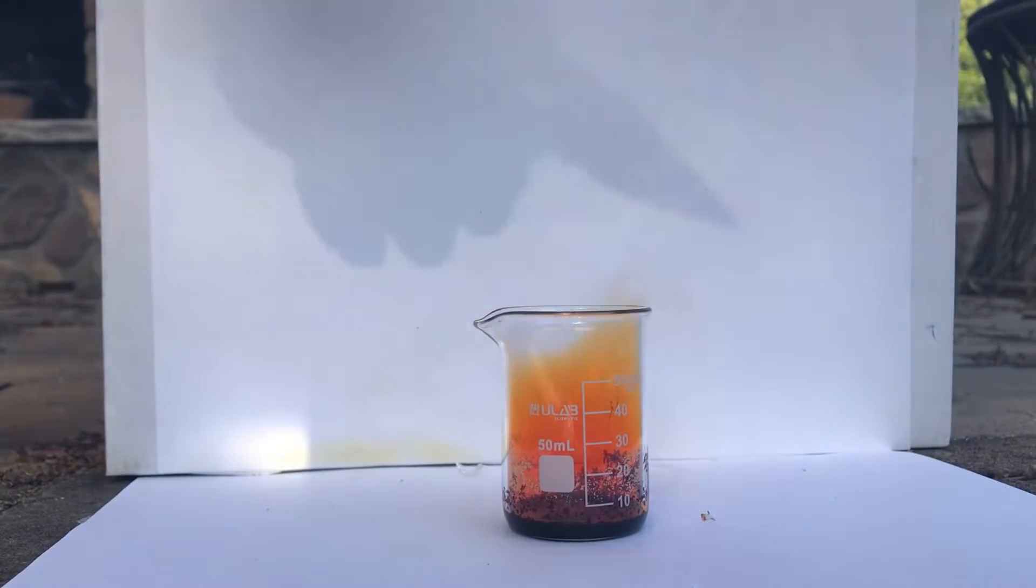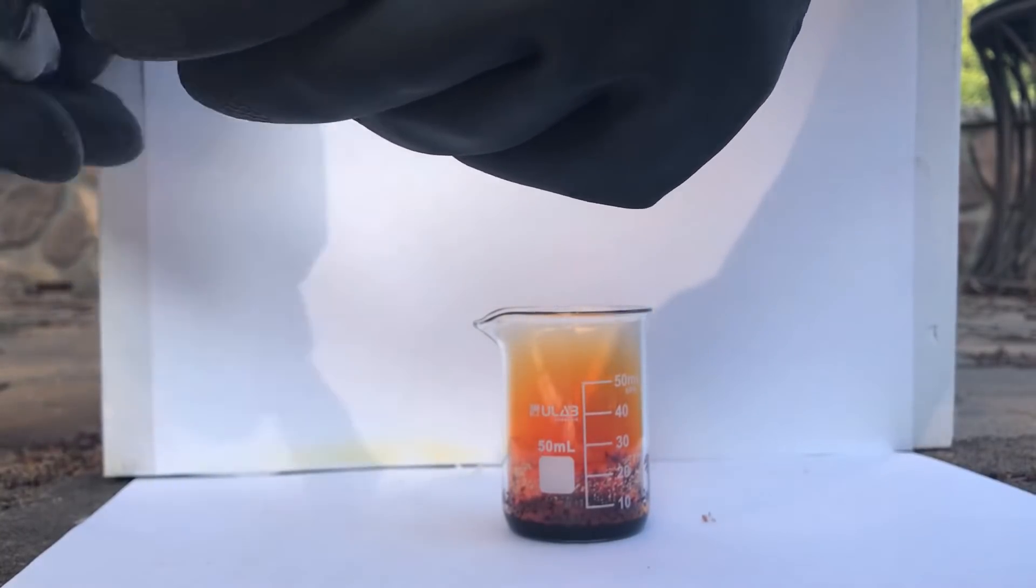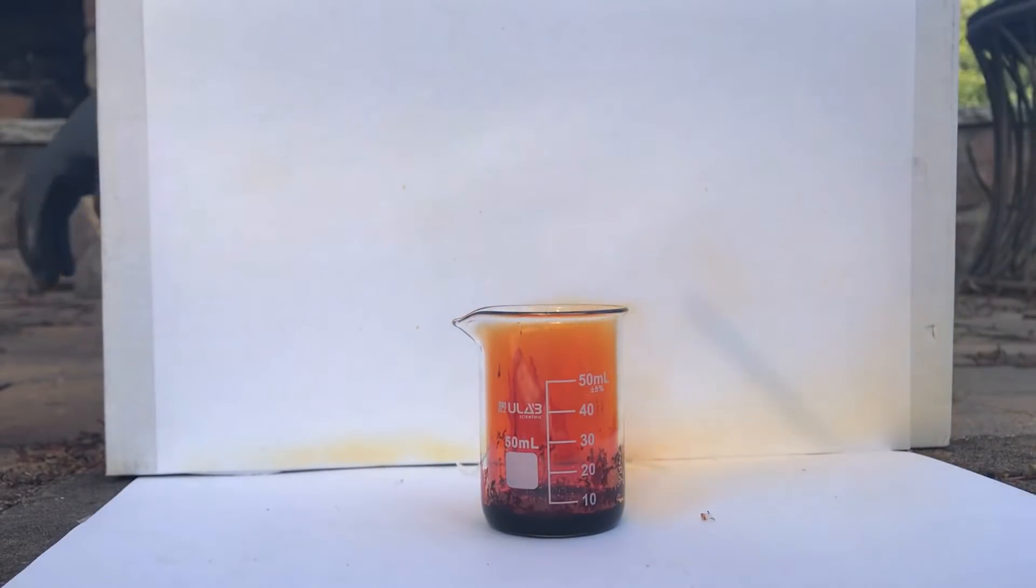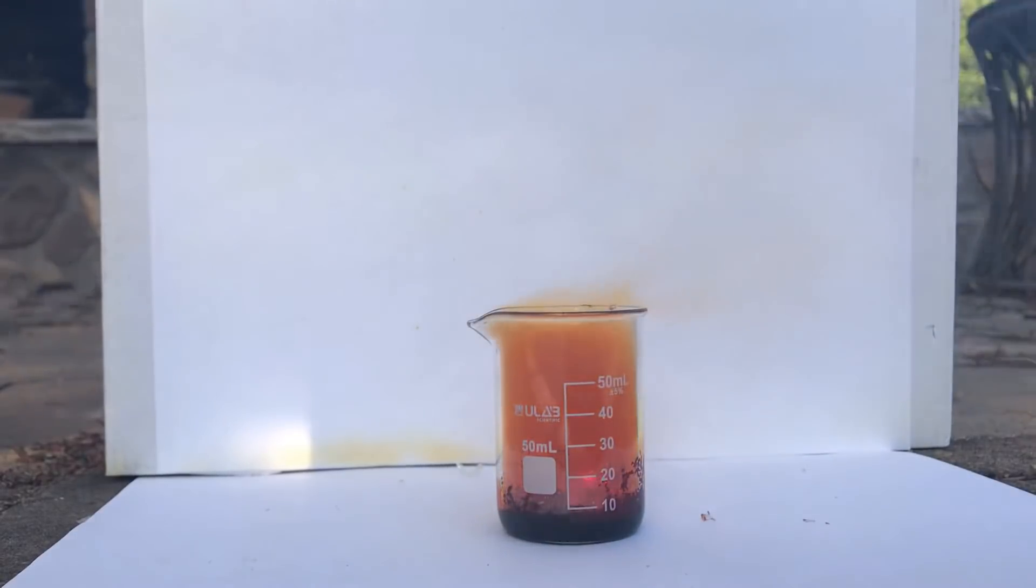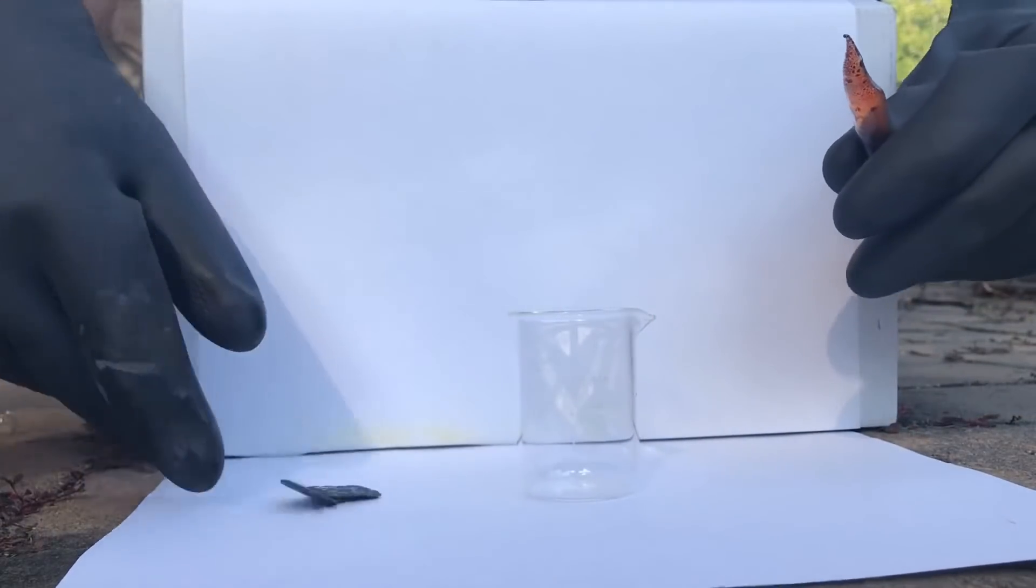Alright, so first we're going to pour in some more bromine, because we're going to try this again. So more bromine, and now we're going to take the torch. Alright, so we're going to be reacting lithium metal with bromine.